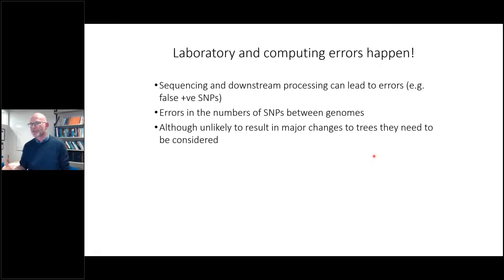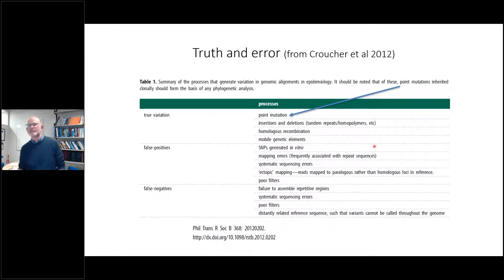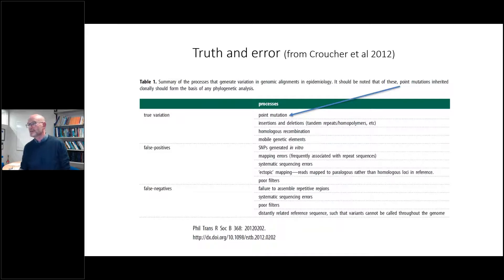Laboratory and computing errors happen — you can get false positive SNPs and false negative SNPs, which can affect your alleles too. Errors between genomes are unlikely to result in major changes to trees, but they are worth noting. Point mutations inherited via replication should form the basis of your phylogenetic analysis. Growing bugs in vitro can generate spurious SNPs as false positives, and failure to assemble repeat regions can result in false negatives — areas where you don't identify SNPs that should be present.